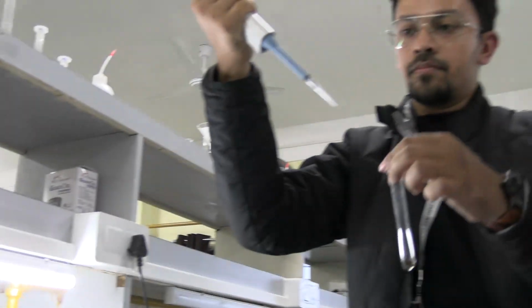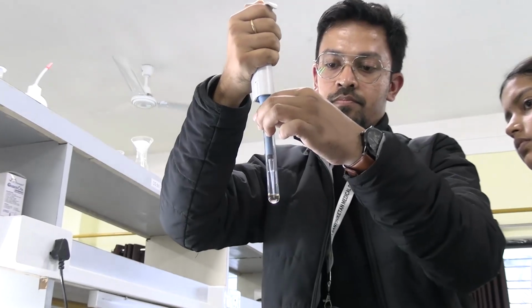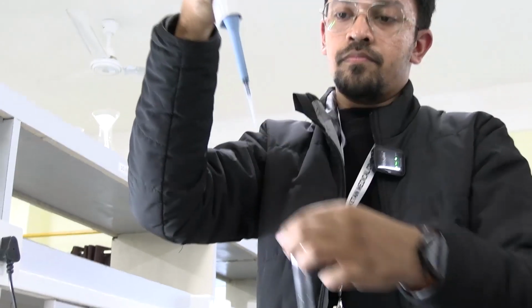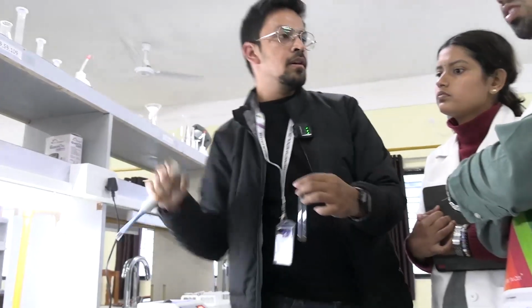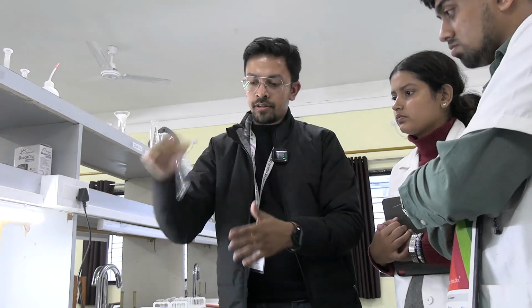Done? This is the test sample. Okay. Now again after the test you have to discard. Why? The next person will come and again do the blank, so the blank should not get mixed with the test. Okay, now my mixtures are done. I'll put it for the incubation.